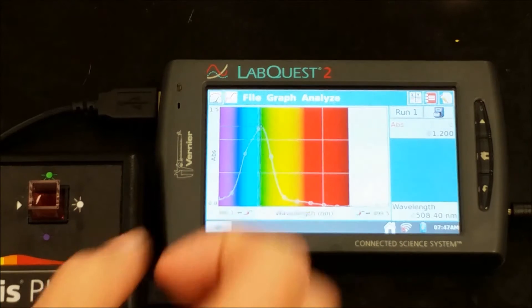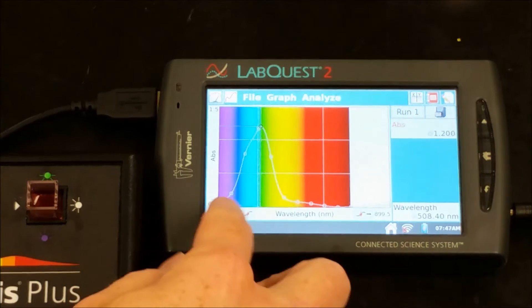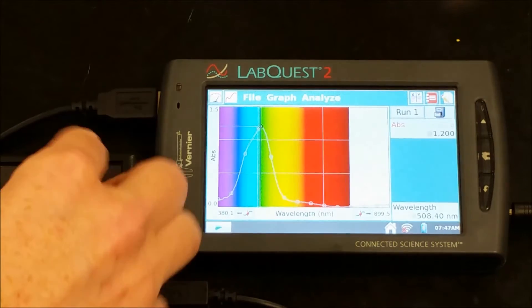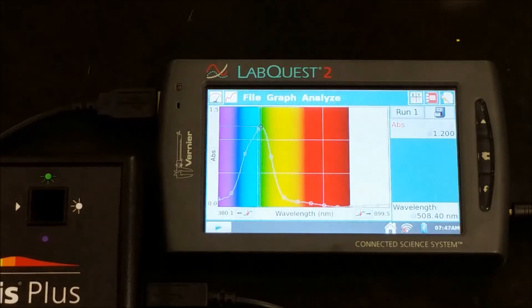We're seeing a lot of green being absorbed, a lot of blue being absorbed, a little bit of violet, and then mostly red, orange, and violet are getting transmitted through the solution.